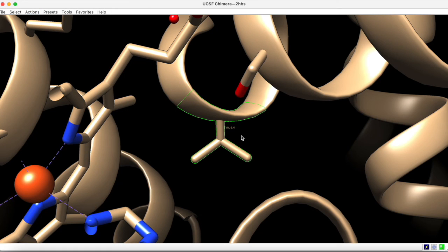This label provides the three letter code of the amino acid, its number, and its chain.